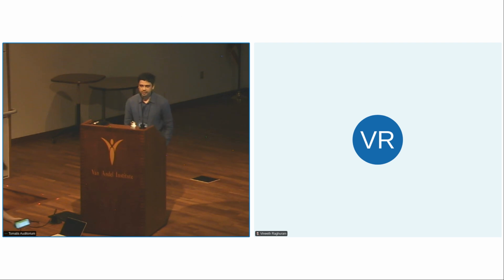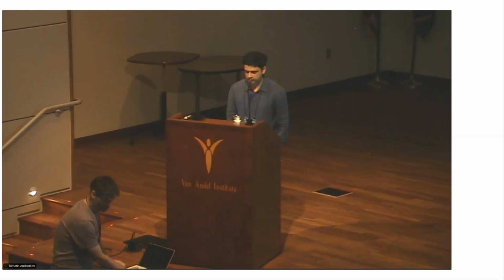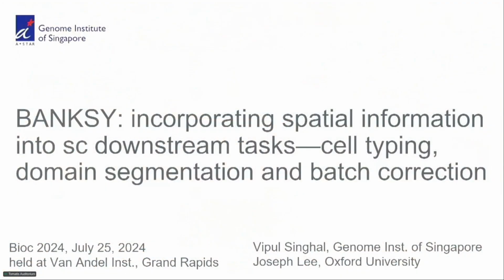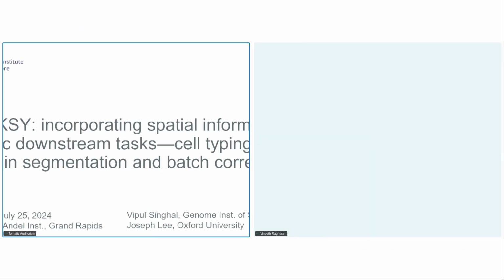Hello. Hey guys, thanks for being here. This is a package demo. The way we'll do this is in two parts. I'll go over the core concepts of Banksy and the use cases and show you some results. And then Joseph will take over, and he wrote a lot of the Bioconductor code. Originally Banksy was its own Banksy S4 object, but then Joseph turned it into Bioconductor compatible SpatialExperiment objects and so on. It's really great work. So he's going to go through the code.